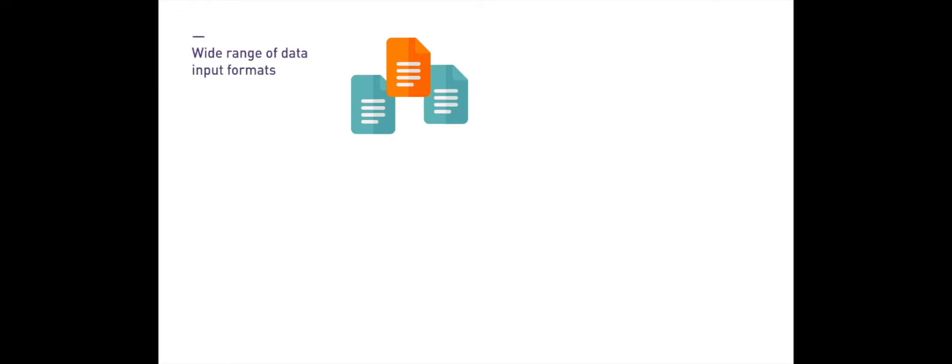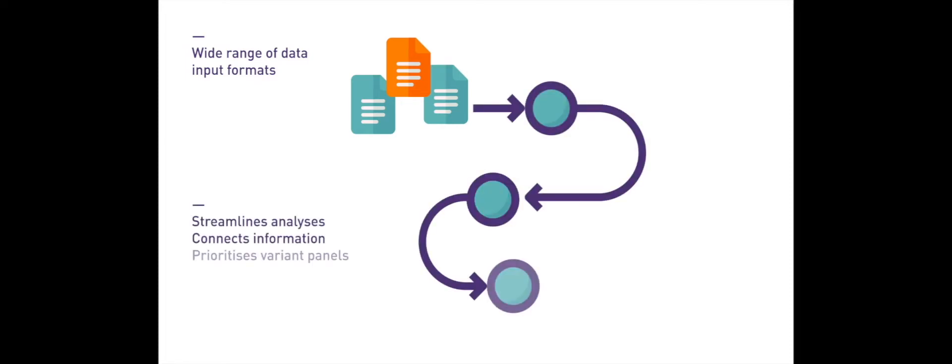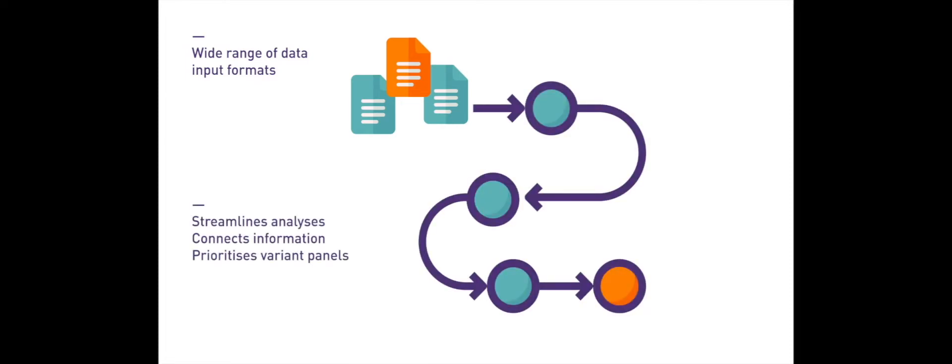SNPnexus allows for a wide range of data input formats, including both single and batch queries. It streamlines complex data analysis and connects information from different sources, allowing for the prioritization of variant panels associated with disease.